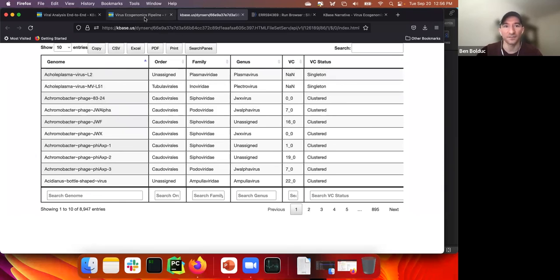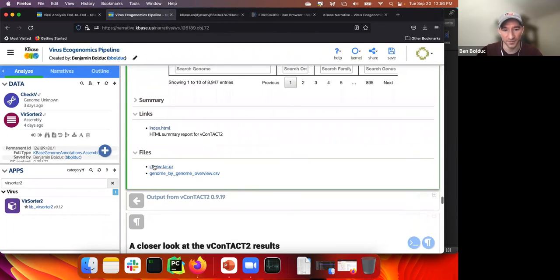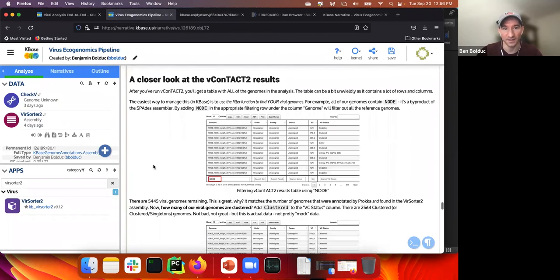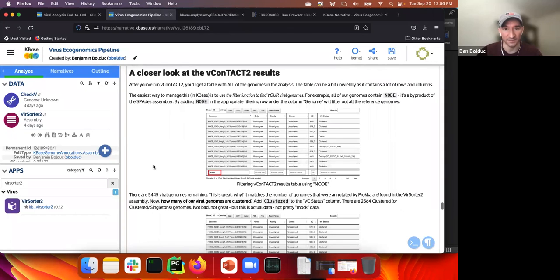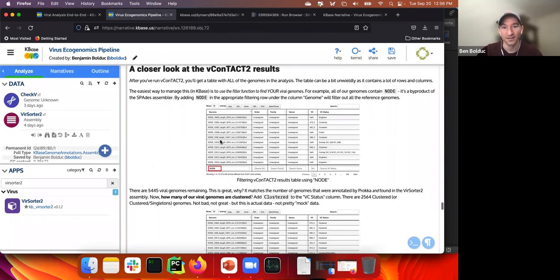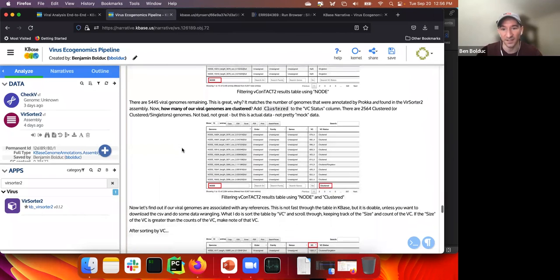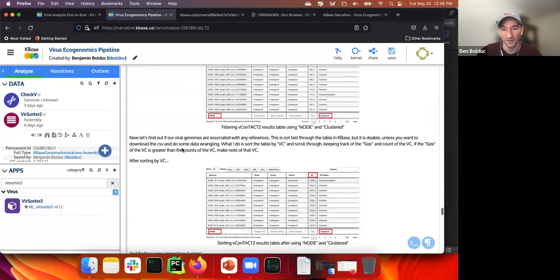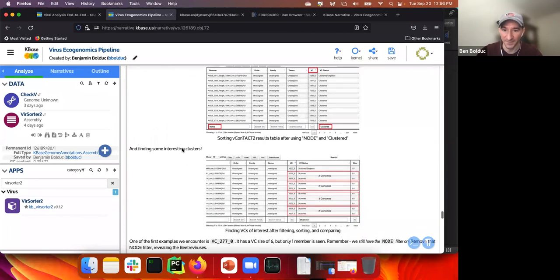And unfortunately, I've almost run out of time. I do not want to take anyone past the meeting time. But I do go through and definitely look at this one. When I said I don't want to have a missing step, this is what I mean. Everything that I would do in order to identify cool and novel viruses is outlined here.